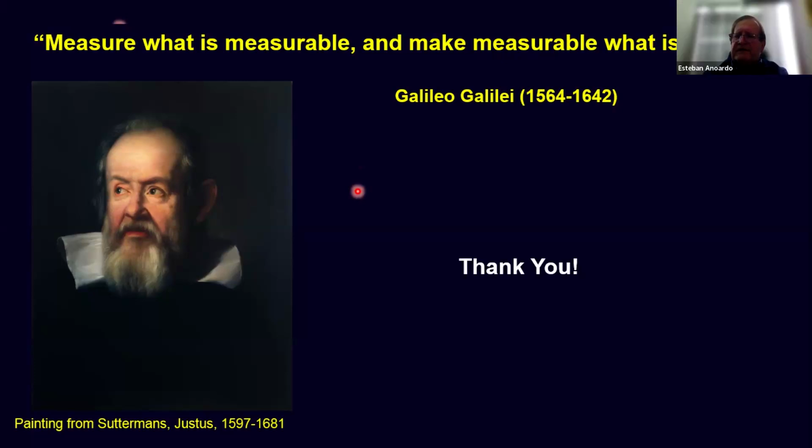It is called pattern search. It works quite well when you have a dimensional space of several parameters, and when the function of the model you are using has a complex derivative.